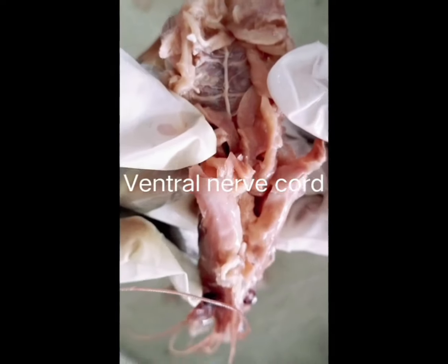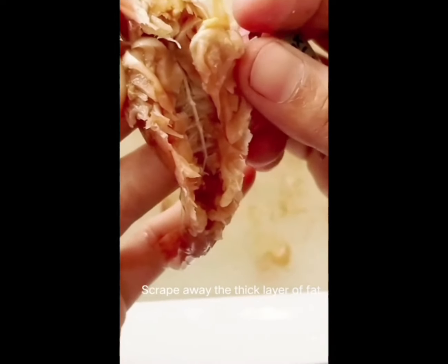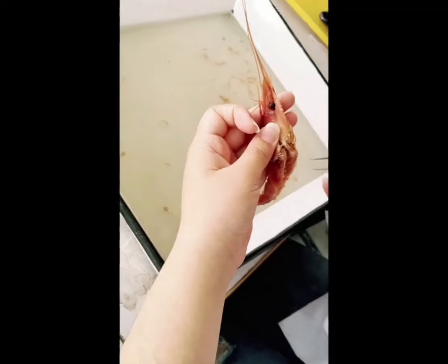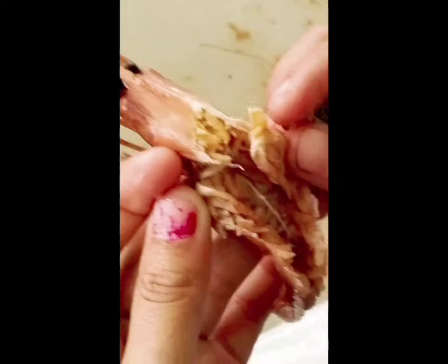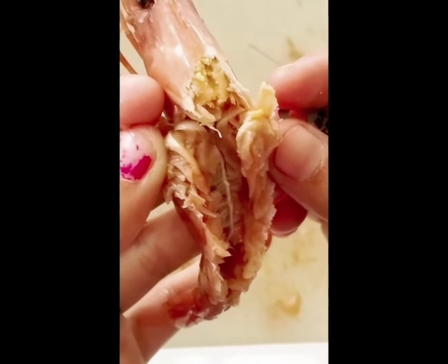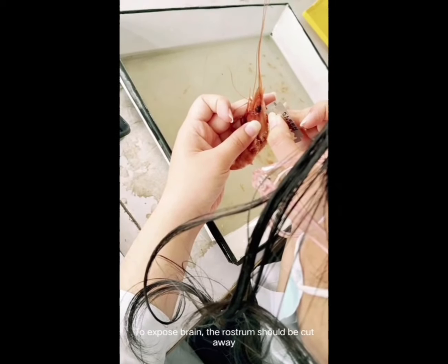Then we can find the ventral nerve cord here. We very carefully remove the remaining abdominal muscles so that the ventral nerve cord is not damaged and is exposed up to the rostrum.